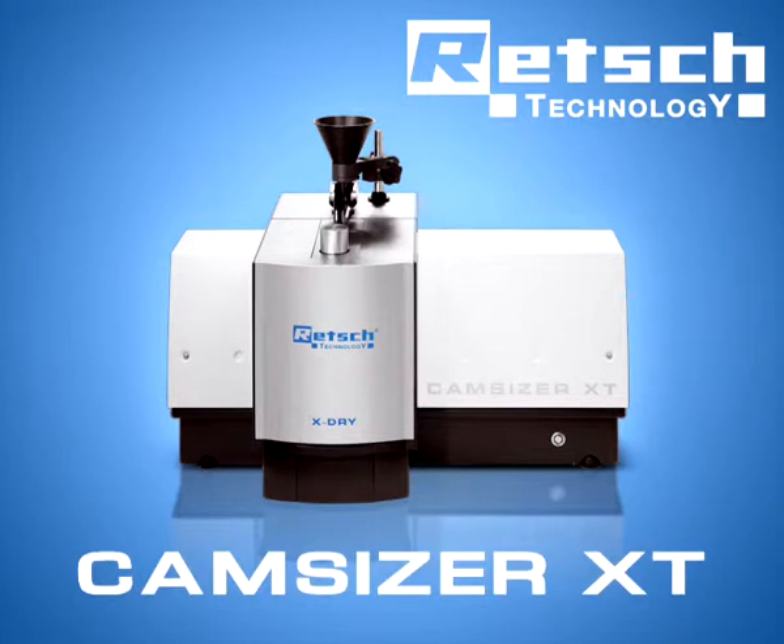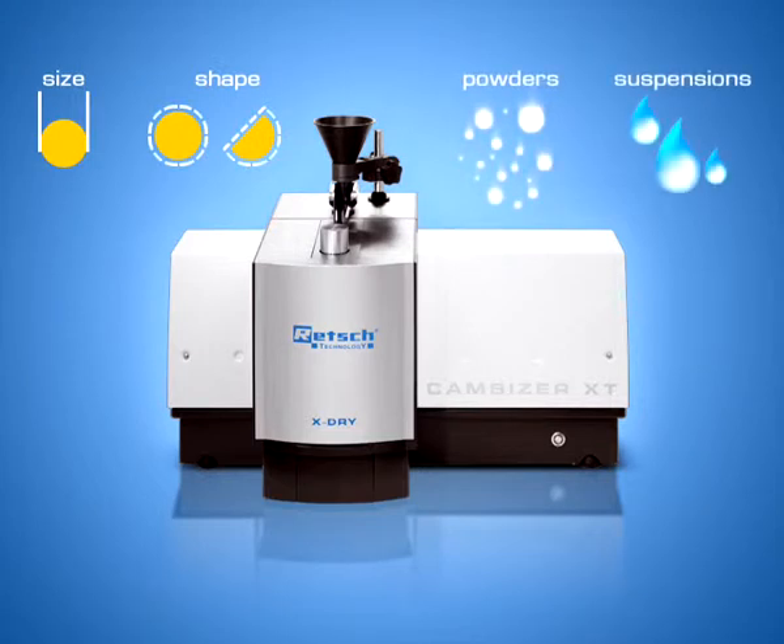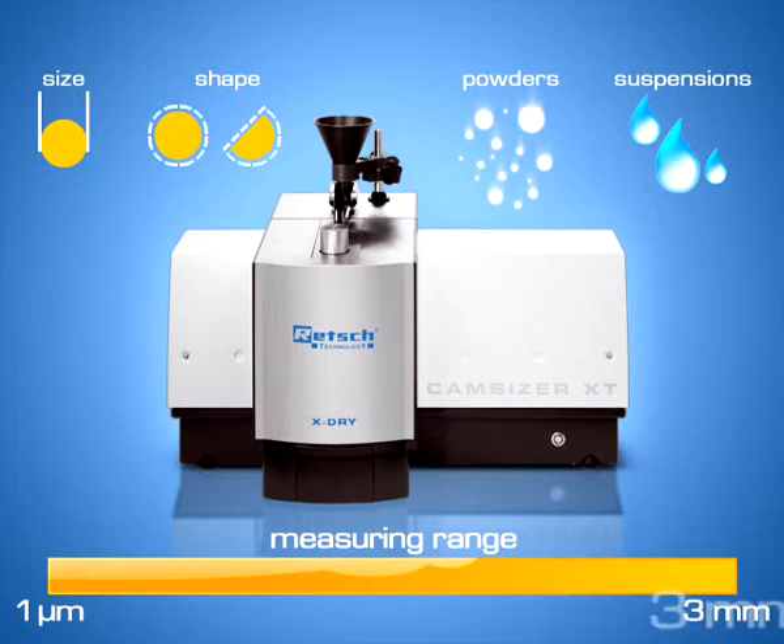The CamSizer XT is a particle analyzer which determines the particle size and particle shape of powders and suspensions. The measuring range reaches from 1 micron to 3 millimeters.